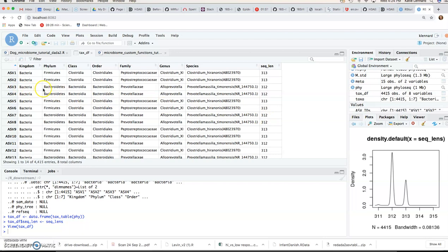And what I want to point out is that for several ASVs you'll find identical species level annotation. And if you actually go look at the underlying sequence, you'll be able to see there a handful, maybe even only one or two base pair changes between these ASVs, which is why they are separate entities.